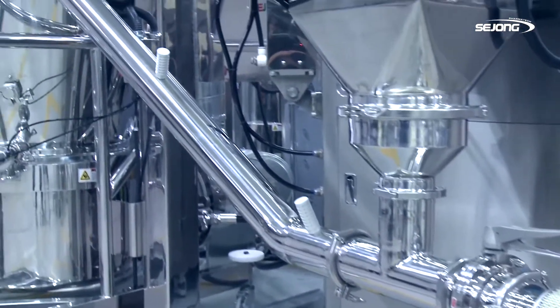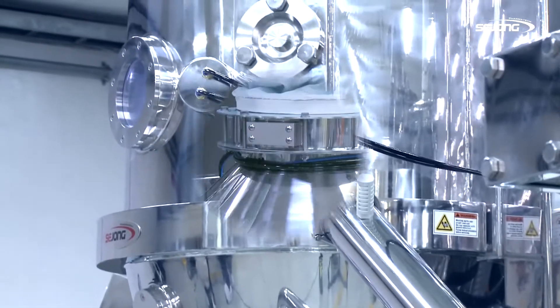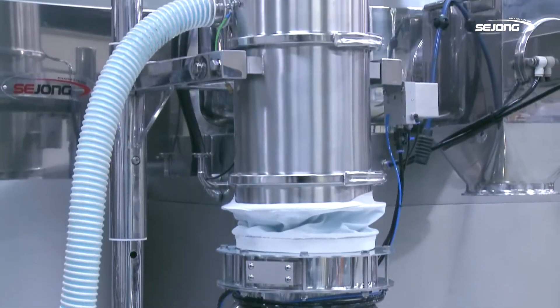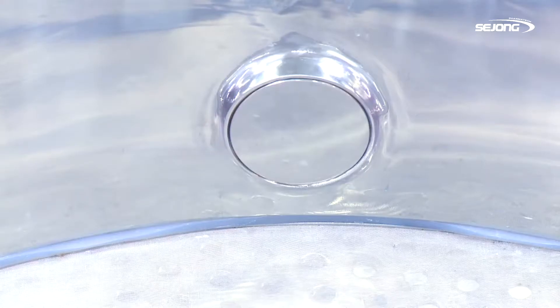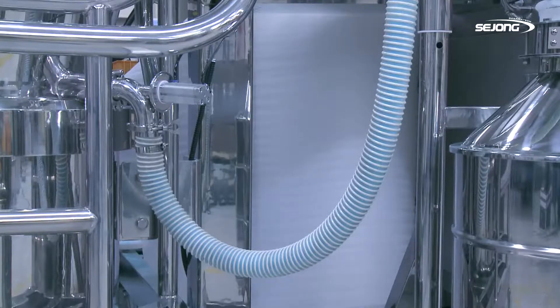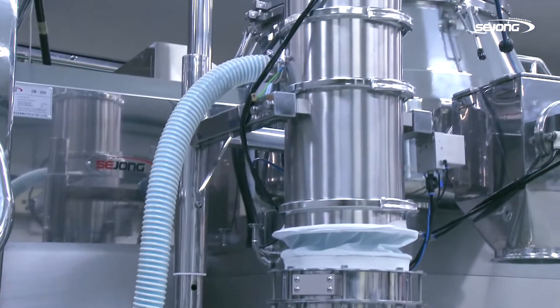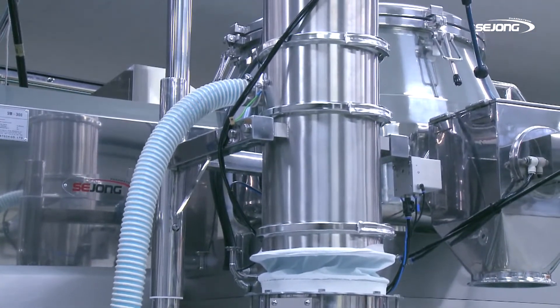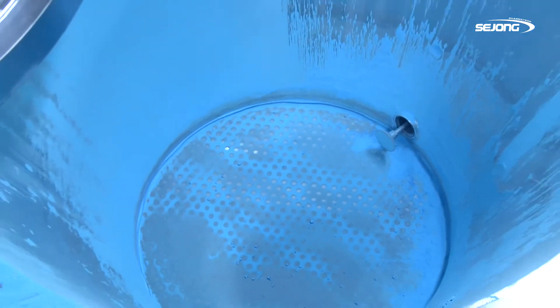D-Series can equip a dust-free system when it is linked to the high-speed mixer. This makes it possible for all processes to be done in a closed type system by feeding raw material automatically and making up a vacuum ejecting system. The operator can control all processes only by checking samples owing to whole process automation, and consequently the operator can be protected from dust and harmful solution in the workspace.